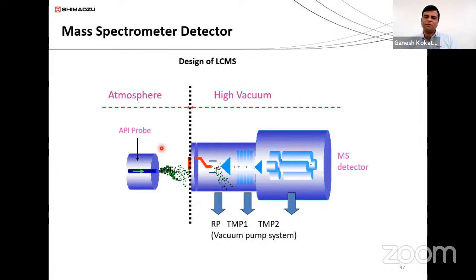Like formic acid or maybe acetic acid, those acids are used in percentages like 0.1, 0.2. So all the acids and all the solvents are getting evaporated over here, and only the analyte containing the charged ion is allowed to pass through the atmospheric pressure region. I hope you are clear, sir. Yes, definitely. Thank you very much. Yeah, thanks a lot.